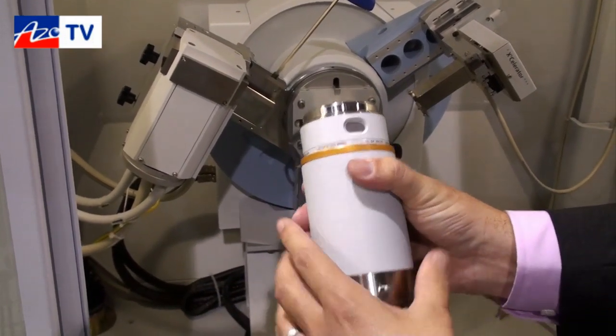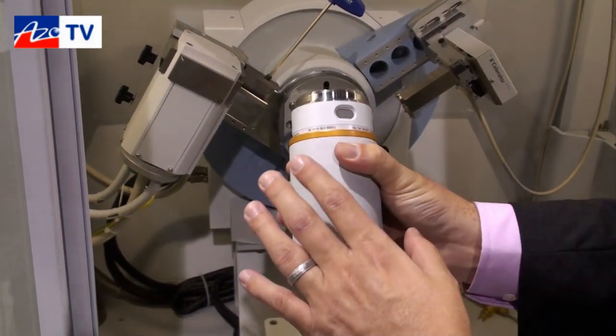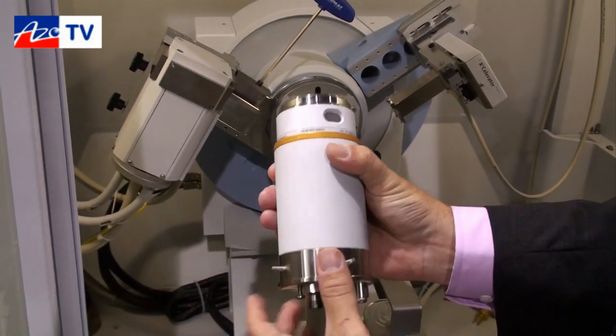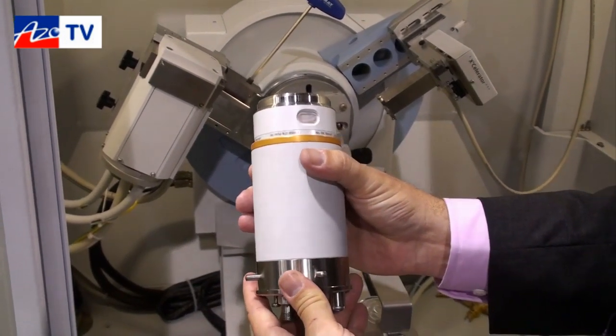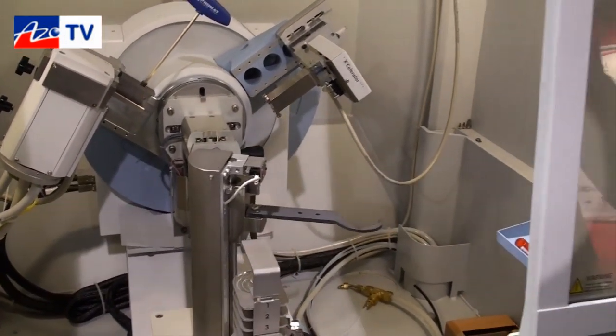We spent years of research and development to ensure that our x-ray tubes last as long as possible, and have zero corrosion effects due to the atmosphere inside the tube tower.